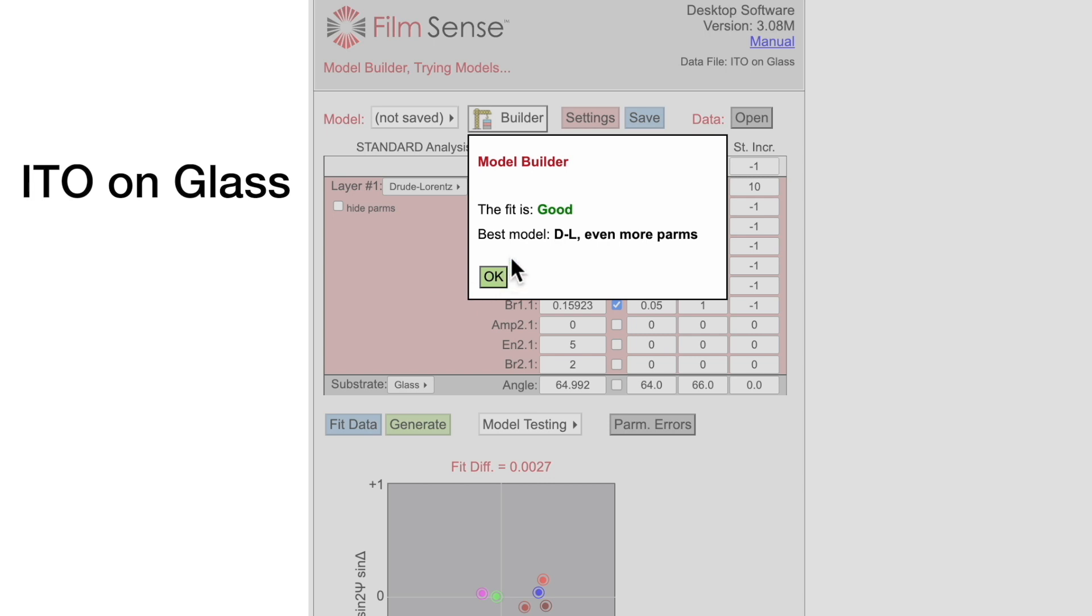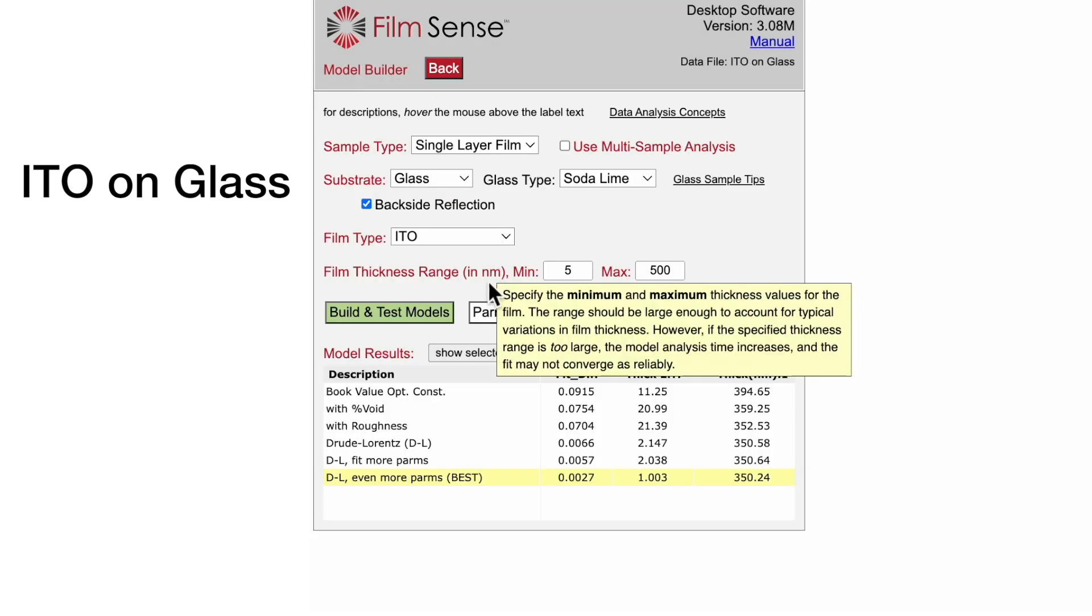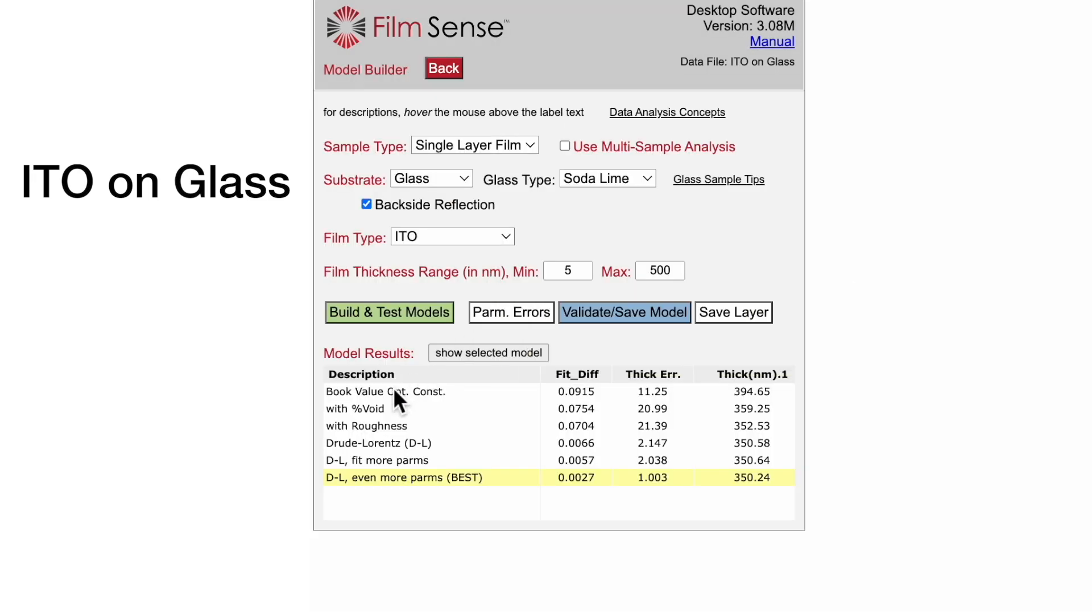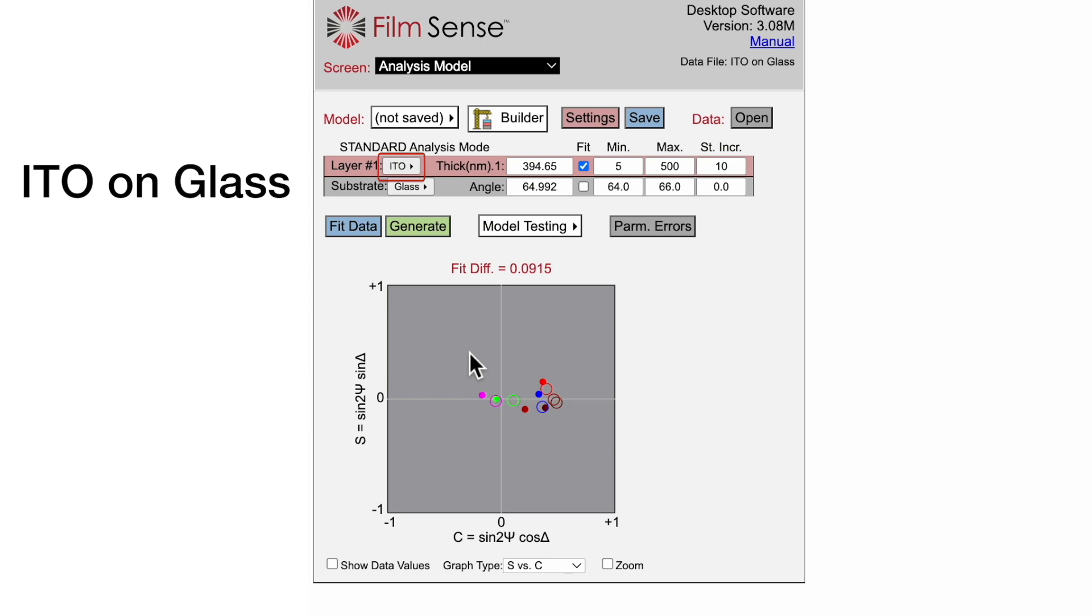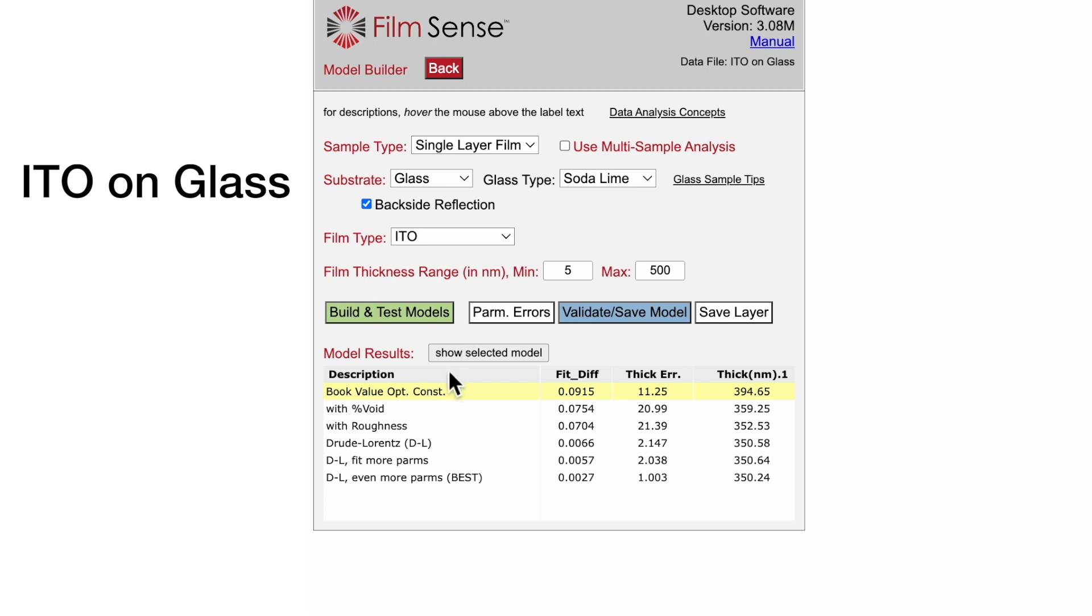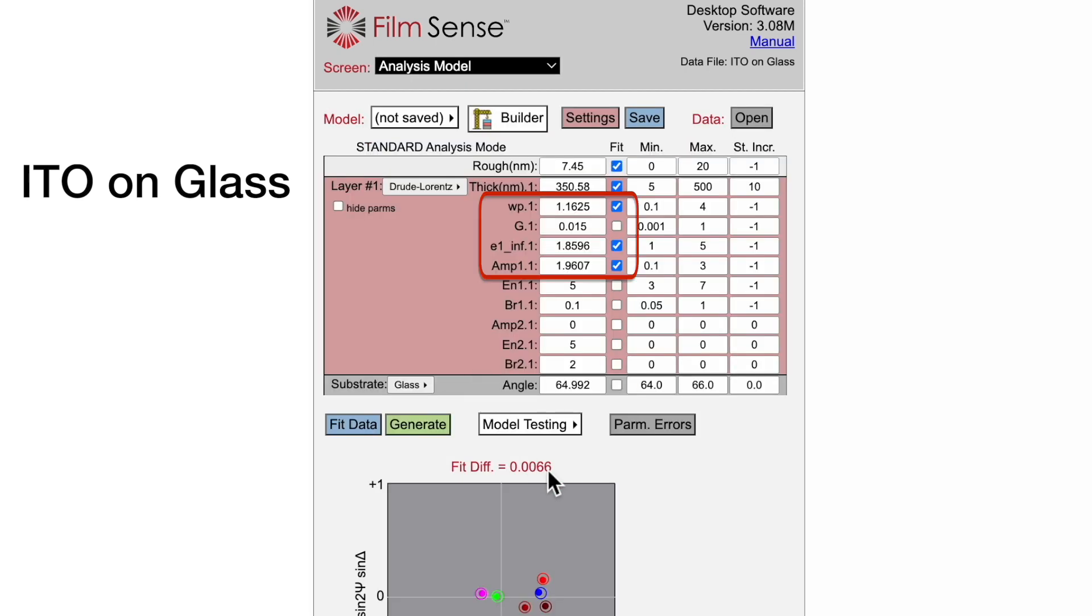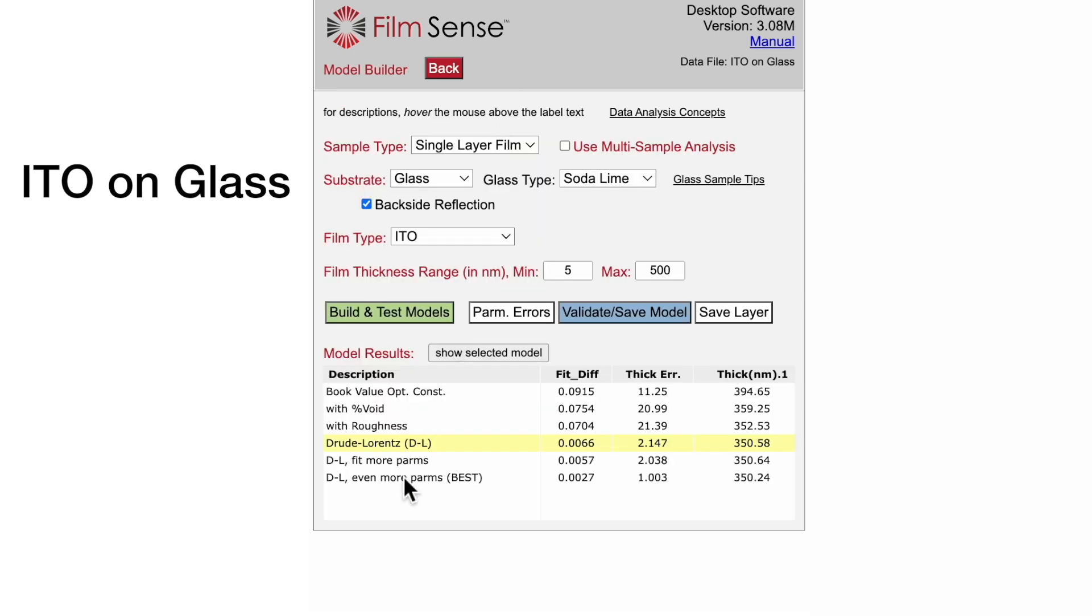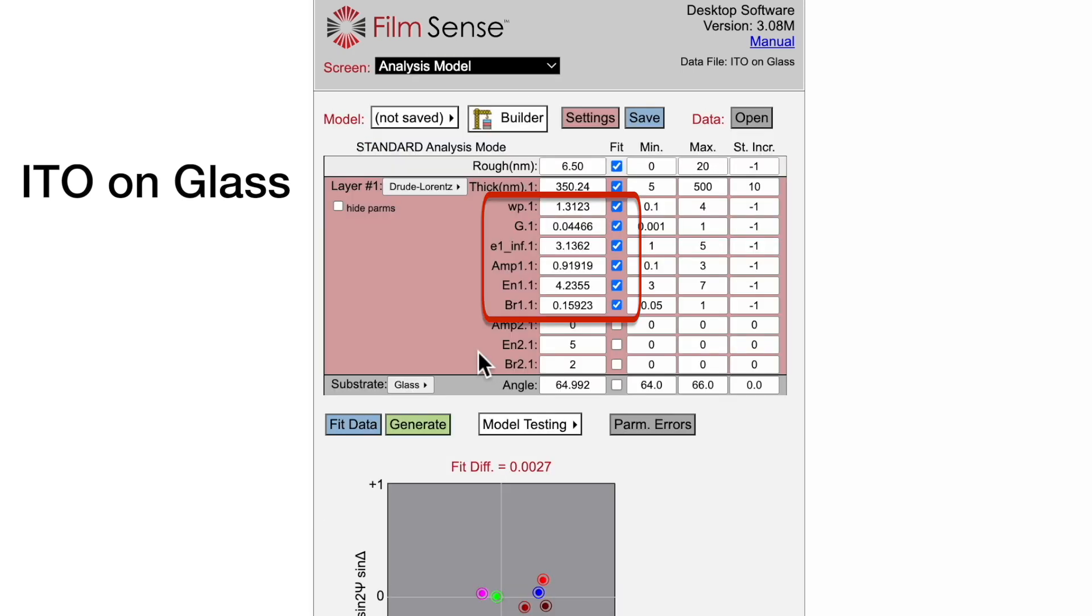And for this sample, the best model used a Drude-Lorenz oscillator layer fitting for even more parameters. As is typical, the model using book value ITO optical constants provided a very poor fit. A Drude-Lorenz model fitting for three parameters provided a fairly good fit, but fitting for even more parameters provided the best fit.